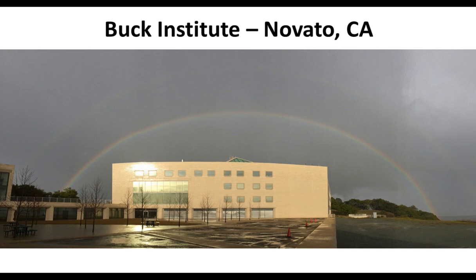We have actually worked with somebody before, Sam Payne is his name, on some of these E. coli projects and bacterial projects. They have actually done analysis just out of the regular lysate without enrichment. But for us, what is really important is not just identifying something, but that we want to quantify them. And when we do these enrichments, the space and the matrix is so much cleaner because you have 60 to 80% of these PTM-enriched peptides now available.